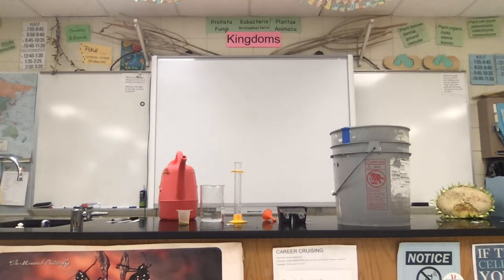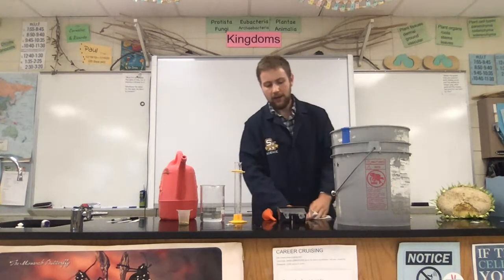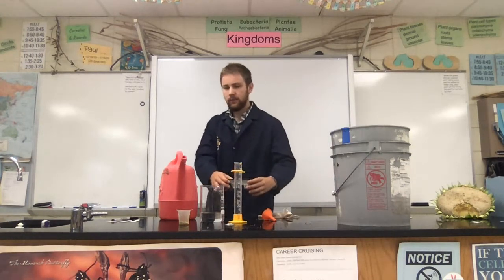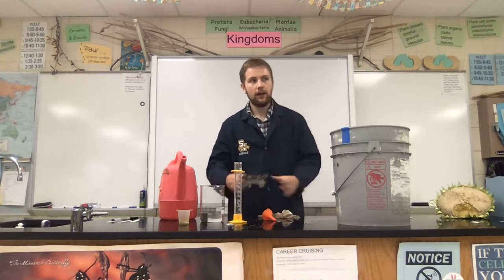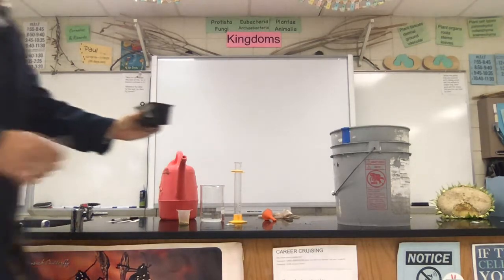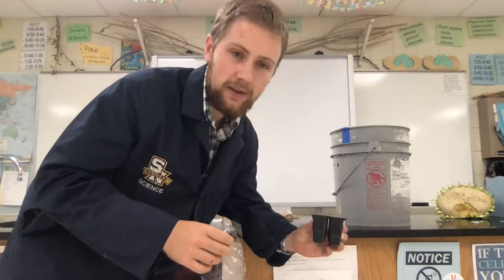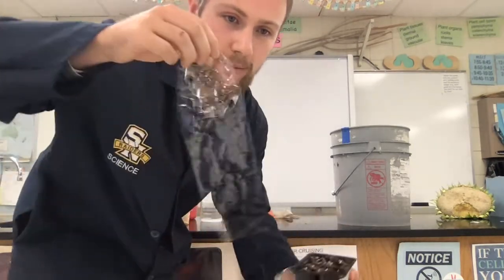So now that everything's set up, most of this experiment, the hard thing is just getting the supplies and setting up. So we've got our water in our container. We've got that all set up. Now what we're going to do is go ahead and cover this to essentially allow the moisture to be held in. So we don't want evaporation, the pesky evaporation, to get to this container and take all the water out. So I went ahead and took a piece of saran wrap.